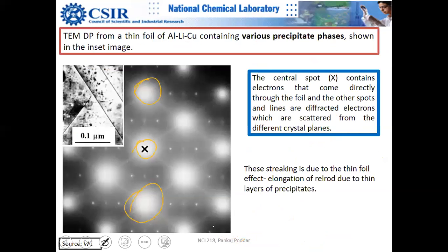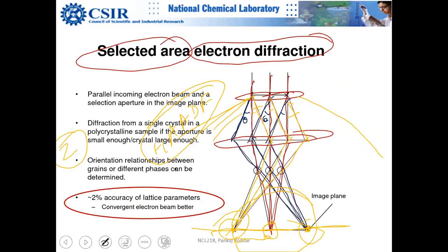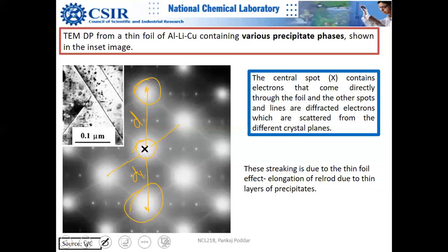Now, what about others? These are actually corresponding points, and they are in the same family. Because spacing is the same from the center, D1, D1, but now this one is different actually, right? So now you can see that there may be other sets of diffraction angles, theta 2, theta 3, for different planes. So that's why you see different sets.